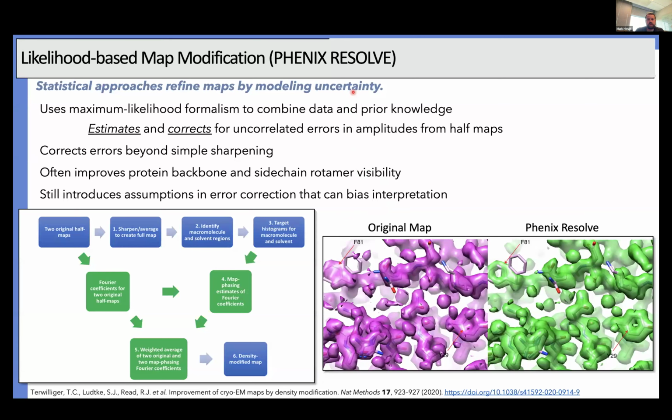It uses prior knowledge of what we would expect for a cryo-EM map, mostly that all of our signal is going to be at the center of the volume, and then as you move away from the center, where you have mostly just averaged noise coming from your buffer components or whatever, the signal should fall off and it should be mostly flat noise.